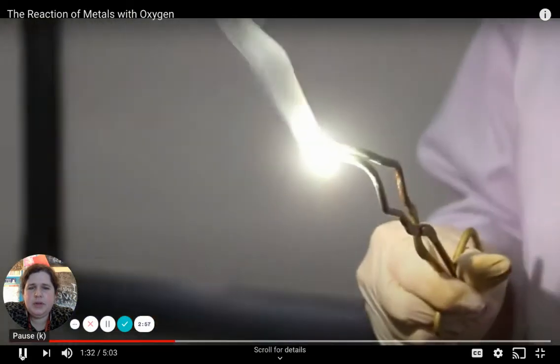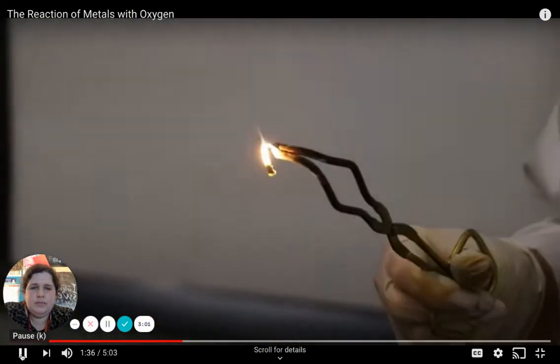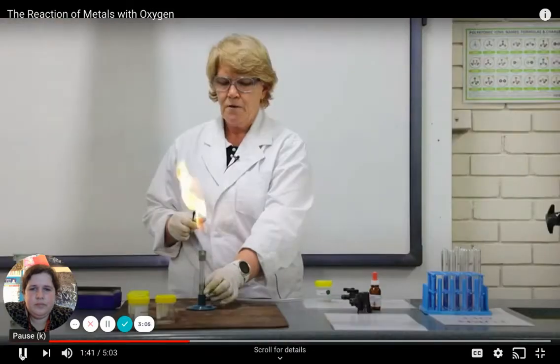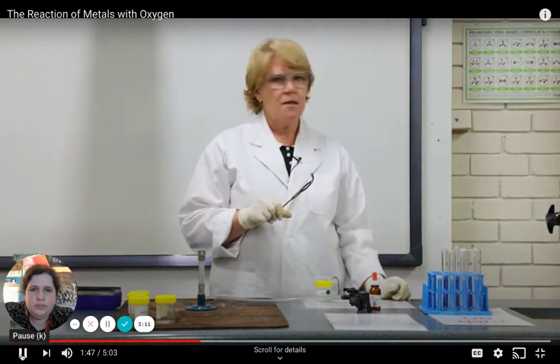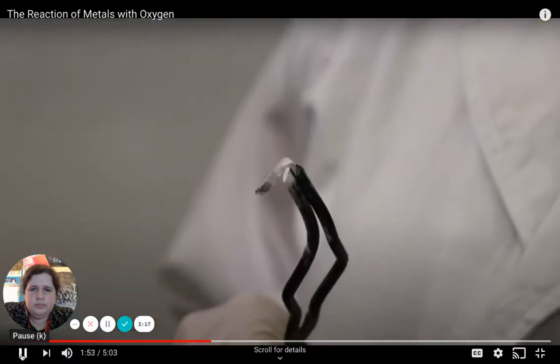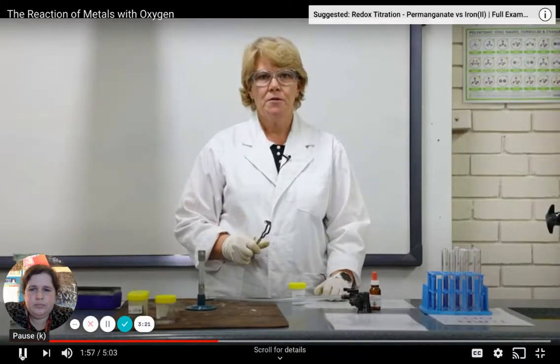So she's looking away because it's a very bright light. You don't want to stare at this light for too long. It can really damage your eyes. Let's have a look at the product of this reaction. We started out with shiny grey magnesium, and now we have a white powdery substance. This is magnesium oxide. Let's look at the reaction between aluminium and oxygen.